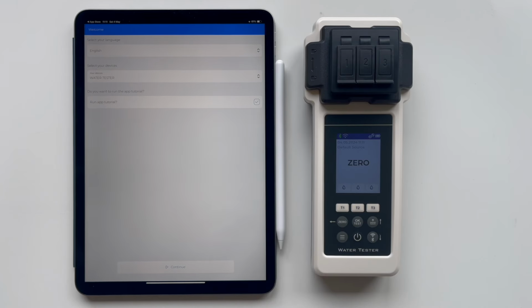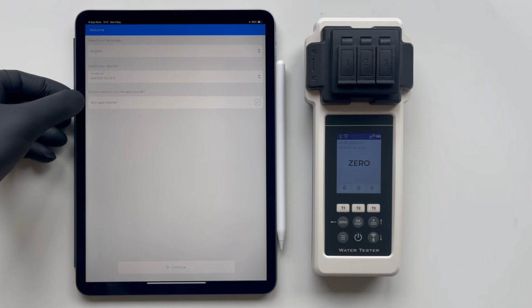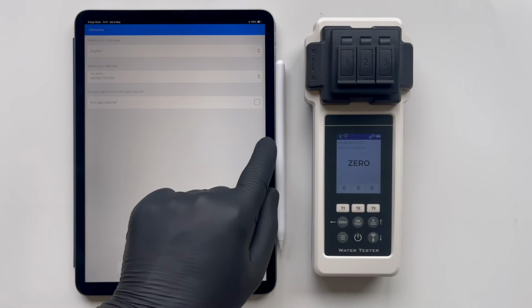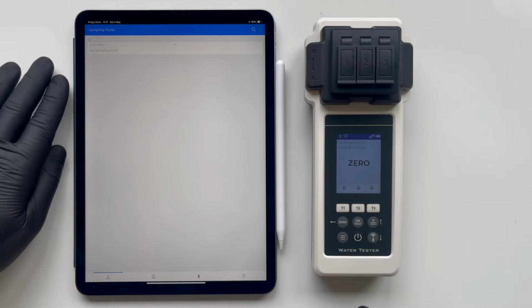Next, the app will offer to show you a video demonstration, which is a helpful feature designed to guide new users through the functionalities and features of the app. You can start and watch this tutorial. However, we will skip this step in order to keep this video concise and to the point. We press Continue. This takes us to the menu where our sample points are located.